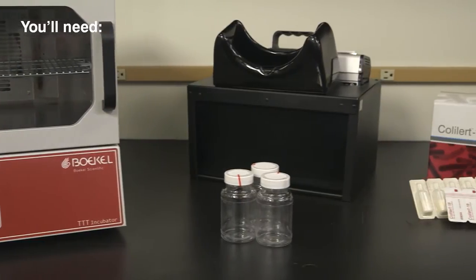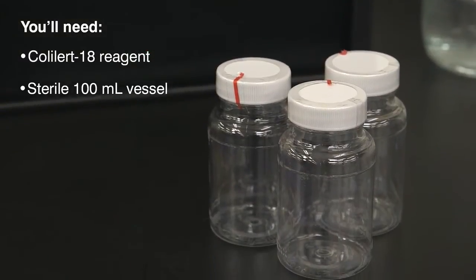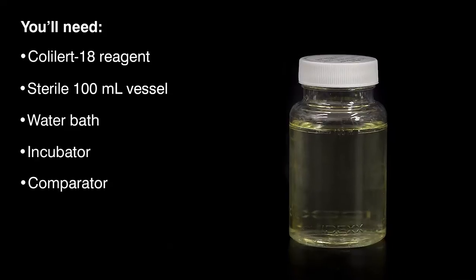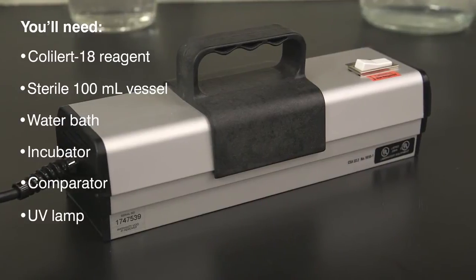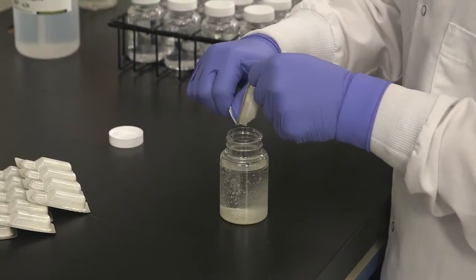You will need the ColAlert 18 reagent, a sterile, transparent, non-fluorescing 100 ml vessel, a water bath, a temperature-controlled incubator, the Coliform E. coli comparator, and a 6-watt, 365-nanometer UV lamp.